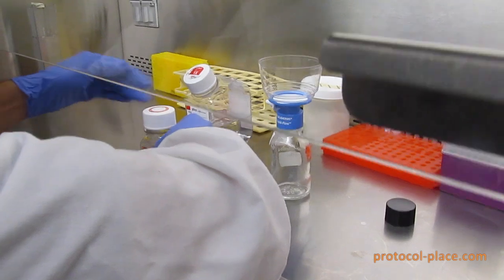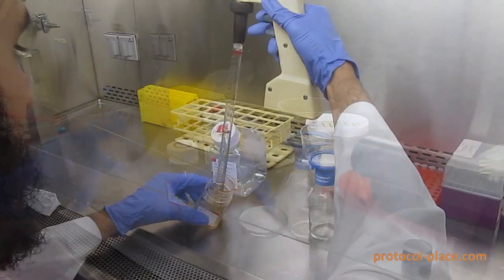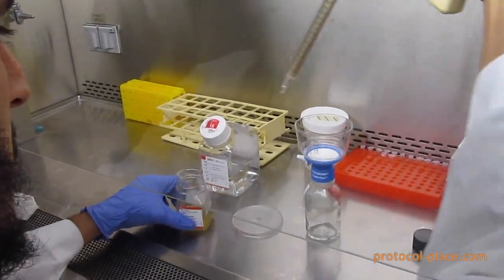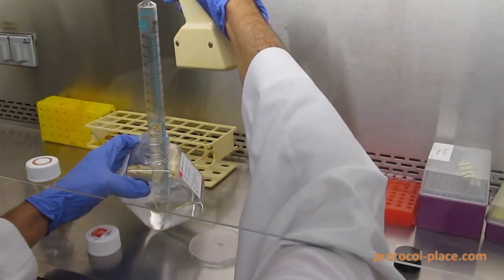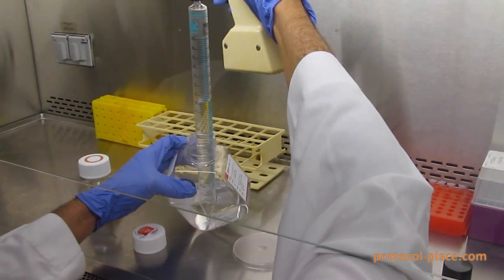After that you're going to open up the reagents that you want to filter and pipette the appropriate amount into the top of the filter. In this case we're going to be combining two different solutions.